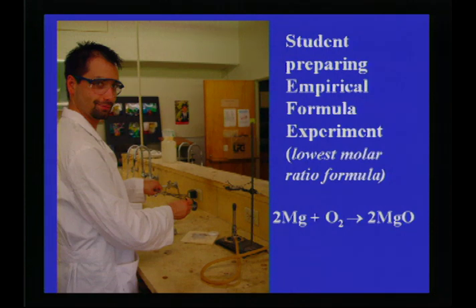According to Lavoisier, we have the conservation law of mass. That means the matter is not produced or destroyed during a chemical change. The atoms just break up their old bonds and create new bonds, as also Dalton formulated. So you see the student is having some magnesium ribbon that he will burn in a crucible to have the magnesium react with the oxygen of the environment, the atmosphere rather, and to make a product.